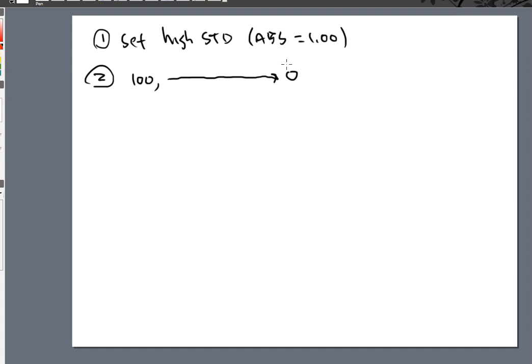All right. So we'll run the 100, the 80, the 60, the 40, the 20, the 10, then the 8, 6, whatever they are, 4, 2, 1, 0, everything in that table we will run. Now, going into this, I know that all of these standards, I'm going to question them. Is that really going to be a linear curve? I mean, that's a really wide window from 0 all the way to 100 for AA and AE.